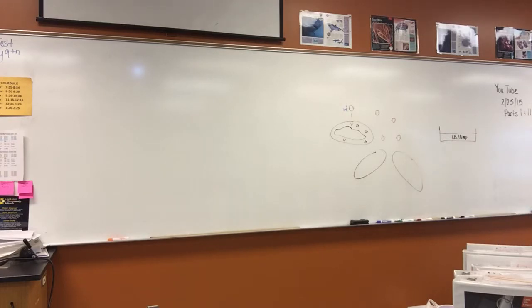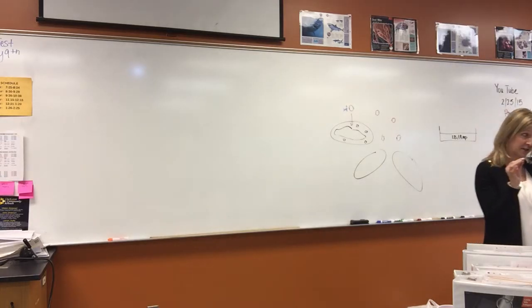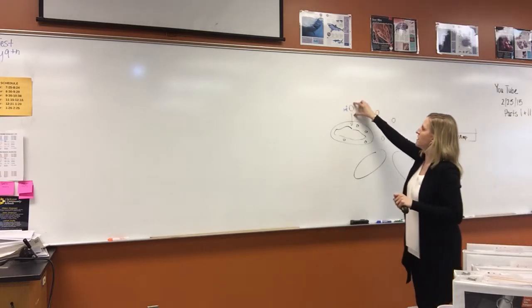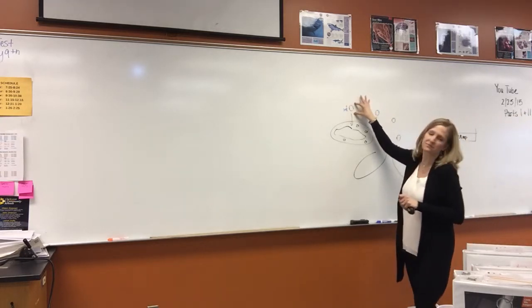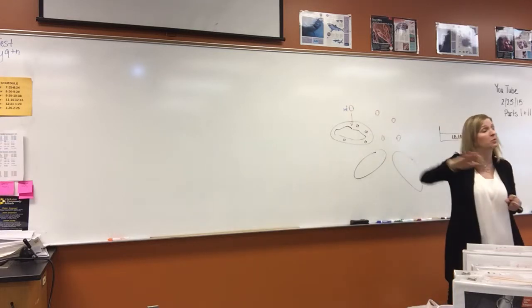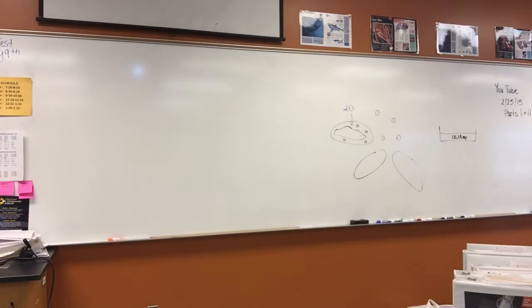All right, so in our lab, as I said, we're gonna do the transformation part. So I ordered what's called the pGLO plasmid. It's the plasmid that contains the green fluorescent protein gene. I already ordered this from the company called BioRad. So I have a recombinant plasmid, so we're not going to do this part. That's why I wanted to do that in the activity on Friday, to kind of get it. That's what literally the company would have done to make the recombinant plasmid.